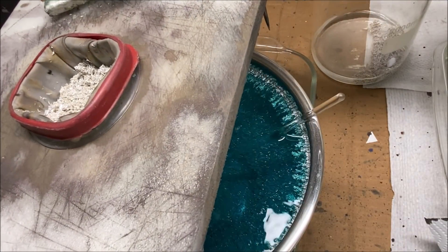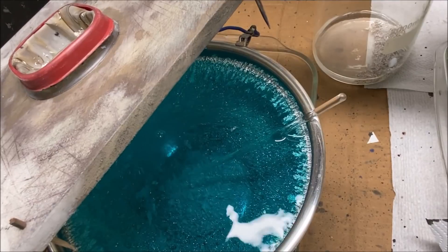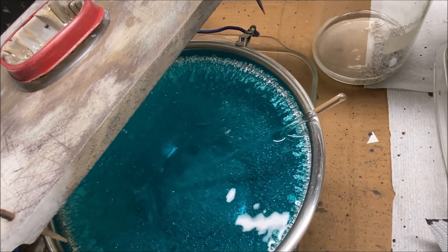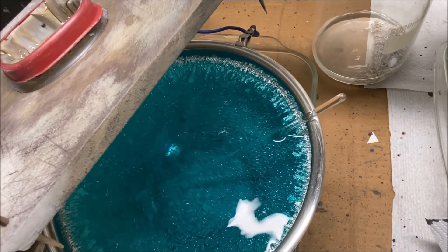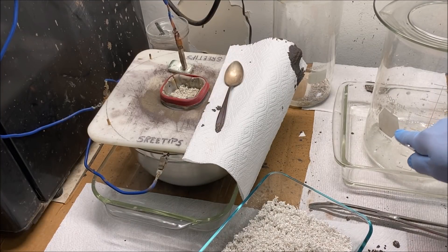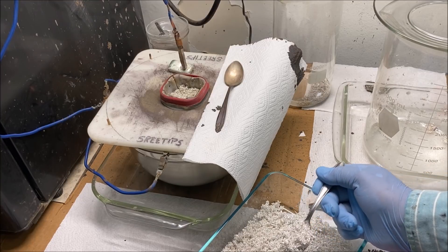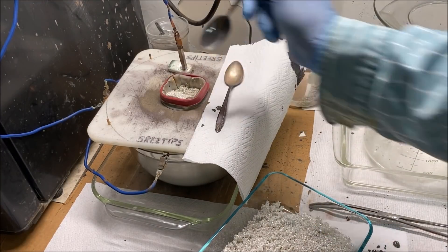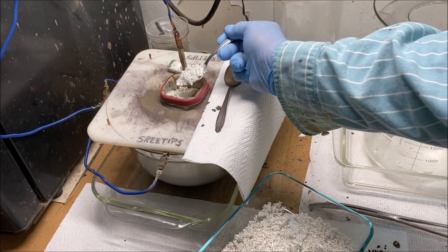Today is Friday — this is day four — and that's what the silver crystal looks like after four days of growth. We started this on Monday. I've used up all the silver out of my beaker over here, so now what I'm going to do is go ahead and start topping this thing off with pure silver crystal from a previous batch. This is high purity silver.